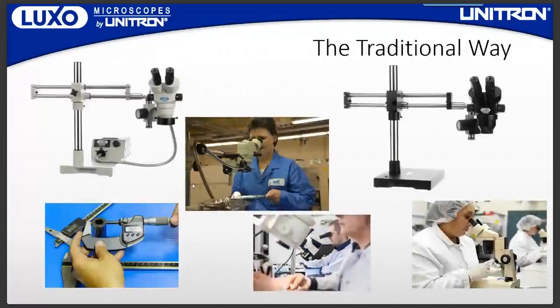Whether you're in a manufacturing, an R&D, academic, art conservation, or another environment, stereo microscopes have been the benchmark approach to observing and inspecting samples that require any kind of magnification. No one is going to argue that stereo microscopes are tried and true technology, and they're generally easy to use.